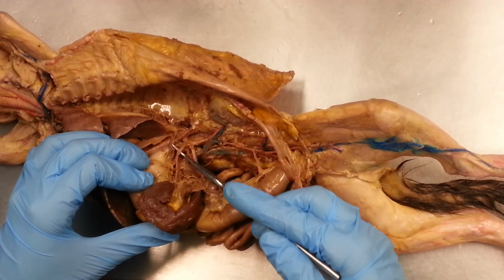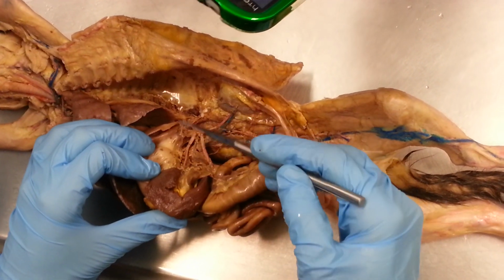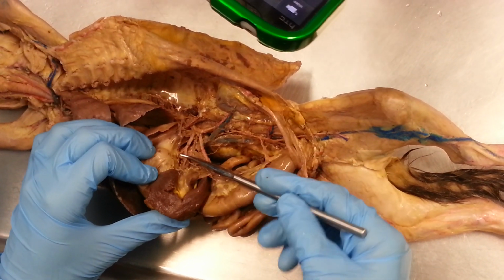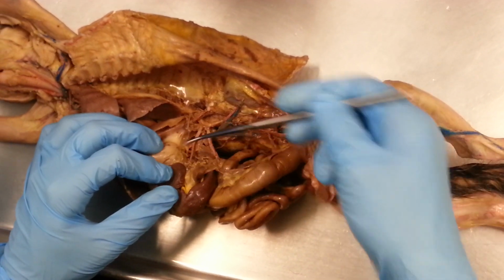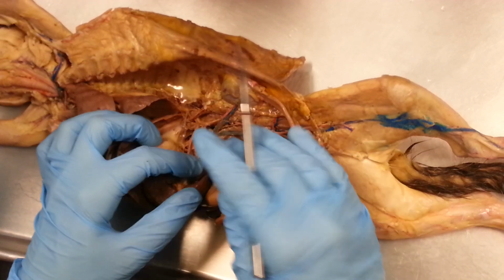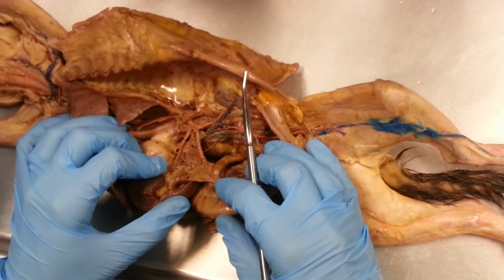So if I pin it here, you know that that's the celiac trunk. If I pin it into the liver, I'll try to get the pin somewhere close to the liver. If I pin it into the gastric, I'll try to get the pin into the stomach. If I pin it into the splenic, I'll try to get it into the spleen. Where's the three of them? 1, 2, 3? 1, 2, okay. 3. Okay. Where's the spleen?